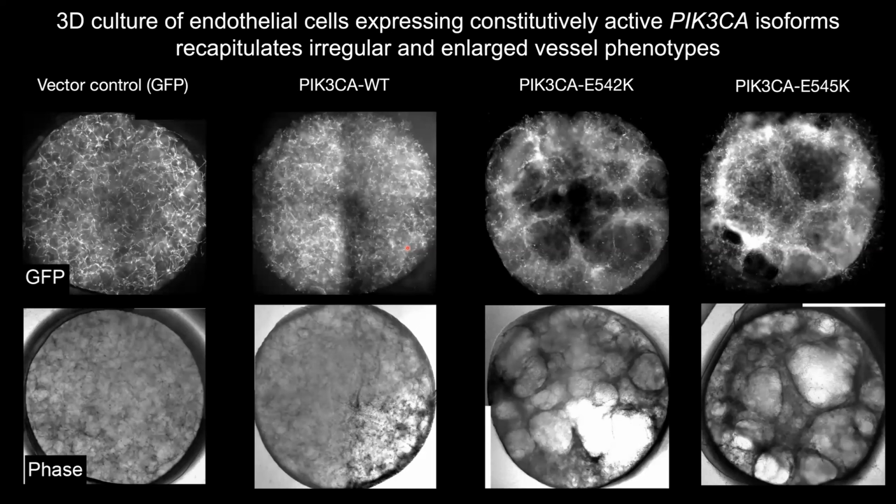But before jumping into microfluidics, we first just created well plates where we seeded individual endothelial cells within fibrin gels in 96 well plates. Actually, this is a slightly smaller format than that. These are custom plates that we make with PDMS to allow us to image certain ways.